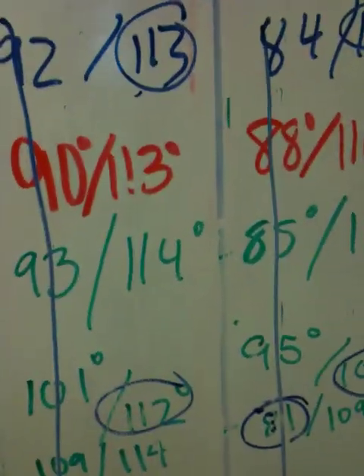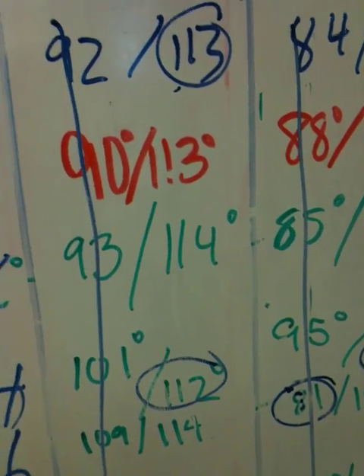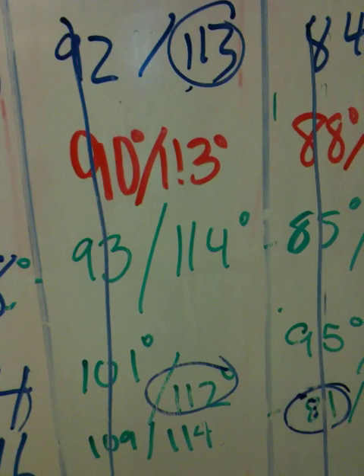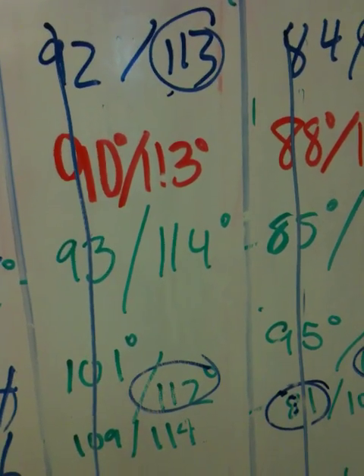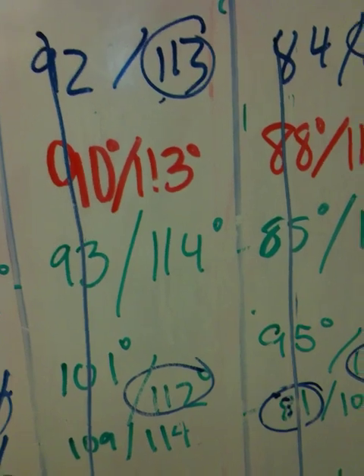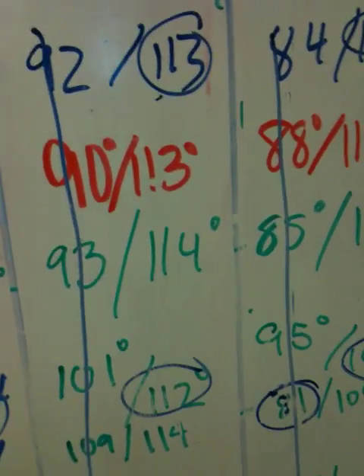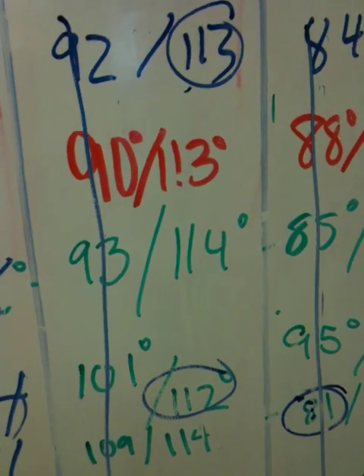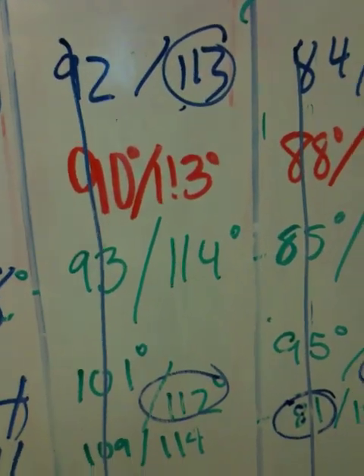The ones I think you should focus on the most for the future are the packing, the sample size being 2 millimeters, and your rate being set so that the change in temperature is 1 to 2 degrees per minute during the melting process. This is very important because, again, you don't heat the sample. You do not measure the temperature of the sample. You measure the temperature of the material around it.